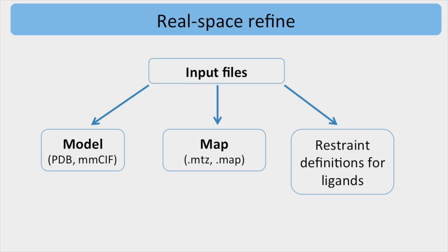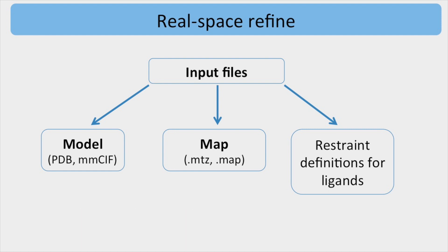For the model, different formats are supported, such as PDB or MMCIF. The latter is especially useful for very large structures.